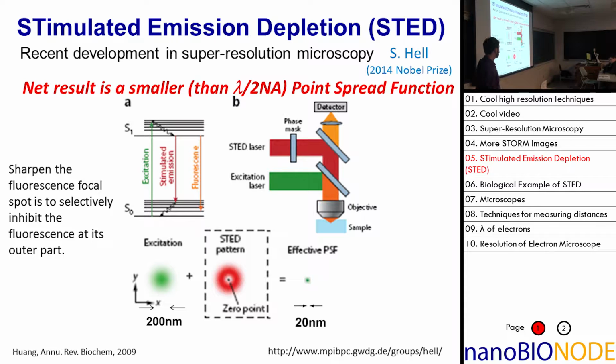This gets super resolution on multiple fluorophores. So potentially, with this technique, you can get more signal out because you're not looking at individual ones, and therefore you can get faster time resolution. And in fact, that is the big difference. This gets faster time resolution. They can go to like 30 hertz with this, where with the other one you don't get to 30 hertz, you get to 0.01 hertz, one image per minute or something like that. So in that sense, this is really great.